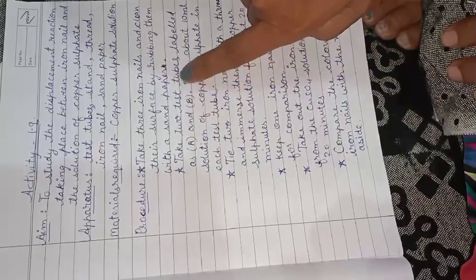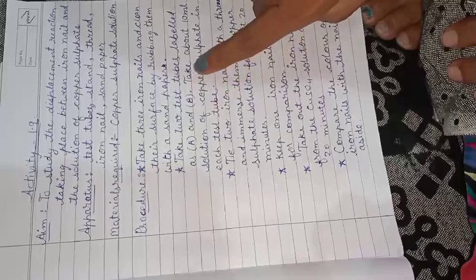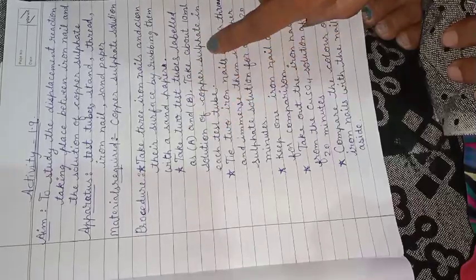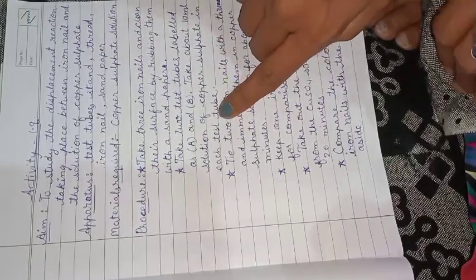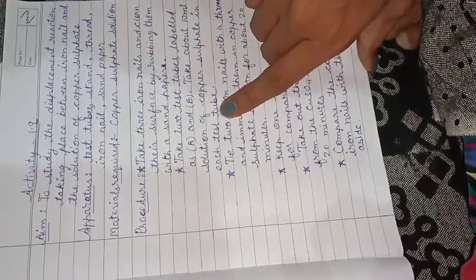We have to take 2 test tubes and label them as A and B. Take about 10 ml solution of copper sulfate in each test tube. दोनों टेस्ट ट्यूब में हमने क्या ले लिया? 10 ml कॉपर सल्फेट सॉल्यूशन ले लिया.